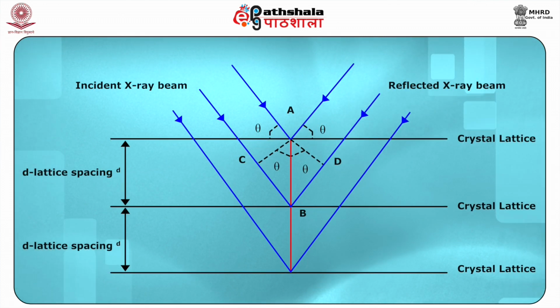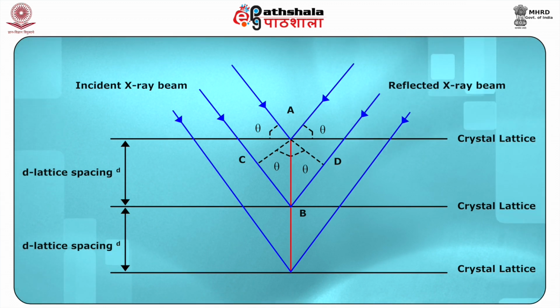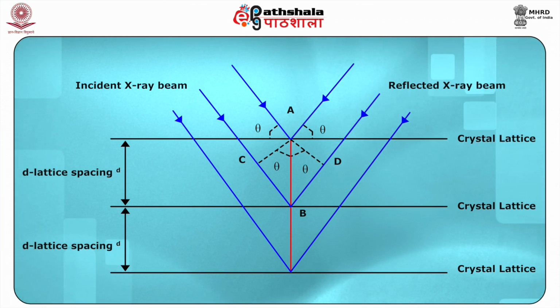The absorbing atoms get excited and emit X-rays of characteristic wavelength of the elements present in the absorbing material, and this process is known as fluorescence. As the wavelength of the fluorescence is characteristic of excited atoms of particular elements, measuring this wavelength enables one to identify the fluorescing element. A greater amount of an element will yield greater intensity and a small amount will show less intensity for the sample, because the intensity of fluorescence depends on how much of the element is present.